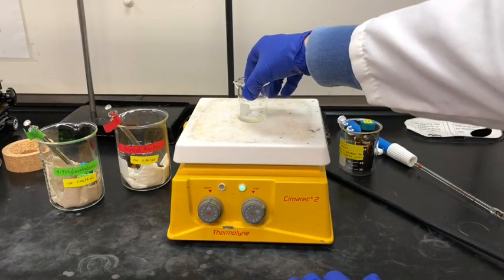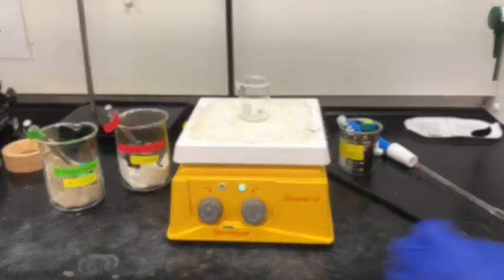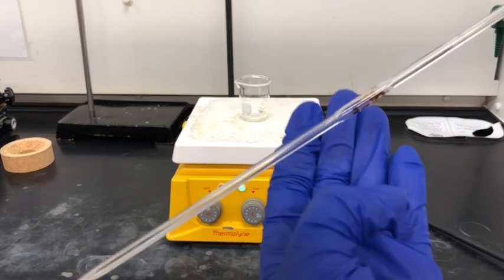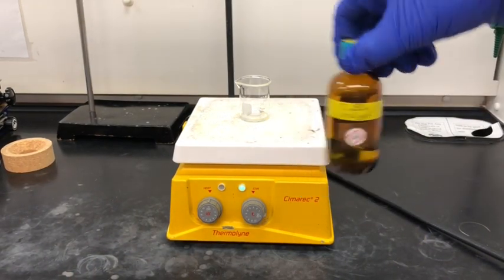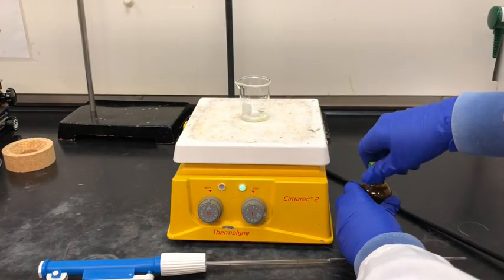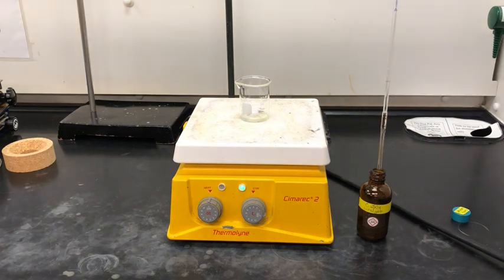Now I'm turning on the stir function on the hot plate — again, we're not heating the solution, we're just stirring. In this next step we're going to add a copper catalyst. We're going to add 1 milliliter of the catalyst, so I'm using a 1 milliliter pipette. Here I'm carefully drawing up the catalyst solution into the volumetric pipette, similar to before, and then I'm going to add this to my beaker.